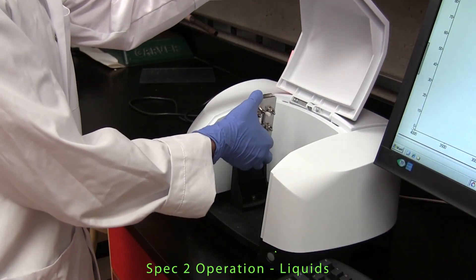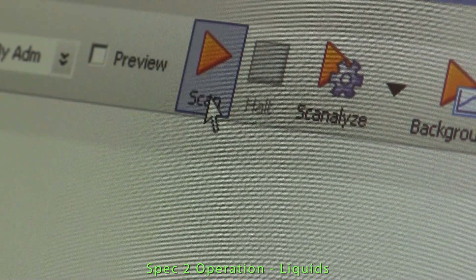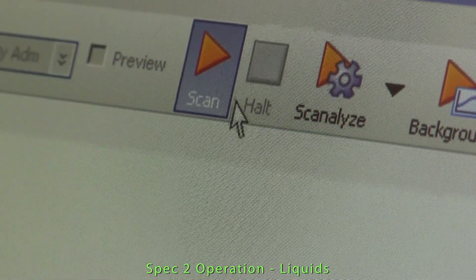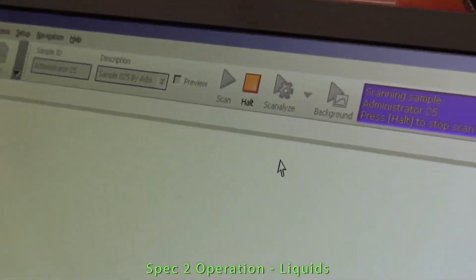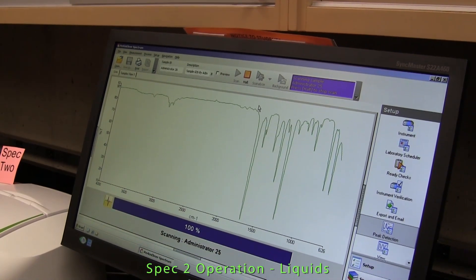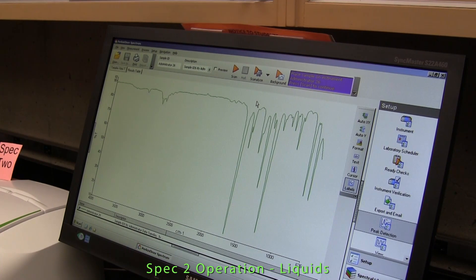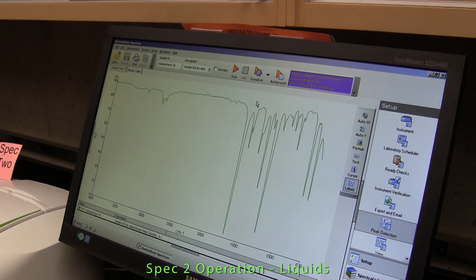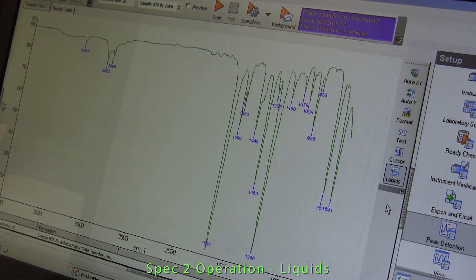The demountable cell containing the liquid sample is placed in the sample compartment. The scan icon is selected and the instrument will now collect the spectrum of the liquid sample. In a few seconds the sample's IR spectrum will appear in the graph area of the screen, and notice that the absorption peaks are now labeled to indicate the position of frequency on the scale.